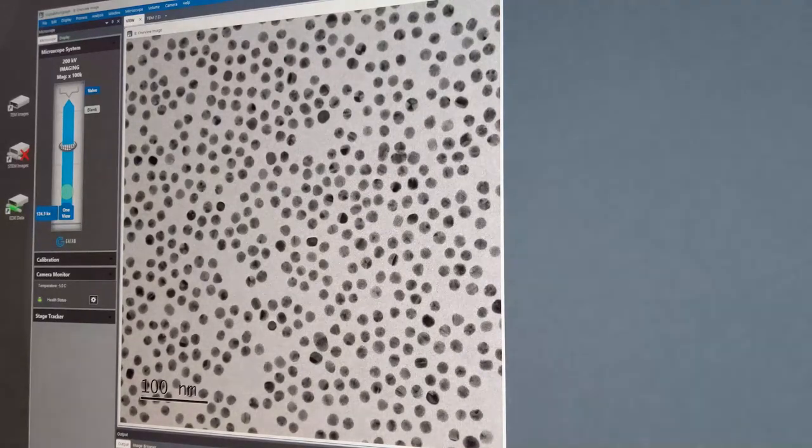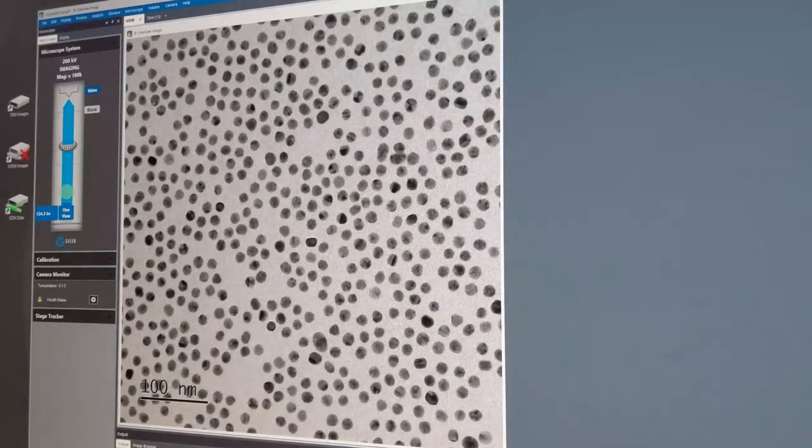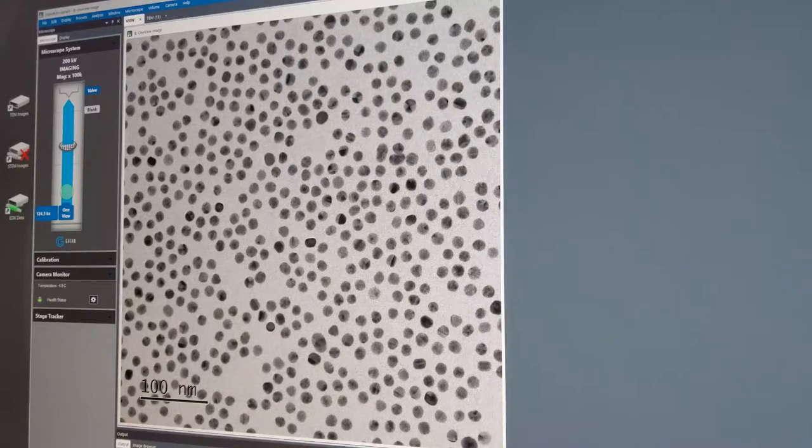So what's happening here is that in these darker particles, there are lattice planes that are lined up at a critical angle with respect to the electron beam. And this means that they're in the right angle for the electrons to scatter in phase. When they scatter in phase like this, we call this diffraction. And we have a mathematical formula for working out the angle of scattering needed for the electrons to scatter in phase. And we call this Bragg's law. This is exactly the same as in X-ray diffraction, except we're using electrons, not X-rays, and so our wavelength might be different, the lambda in Bragg's law.